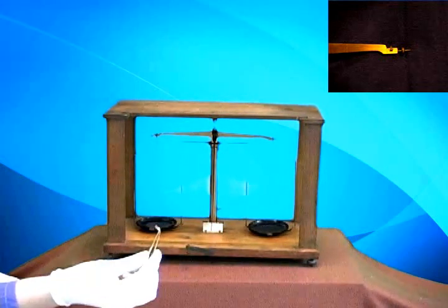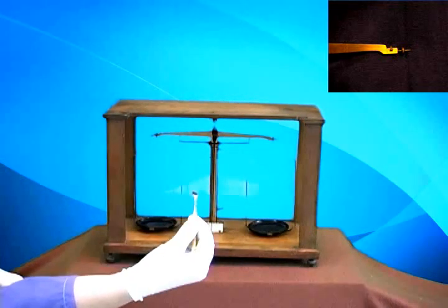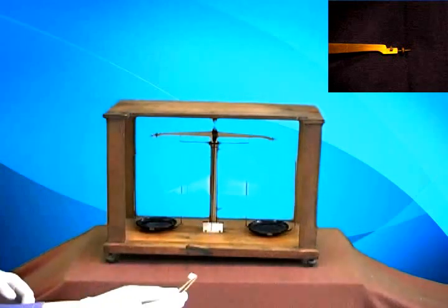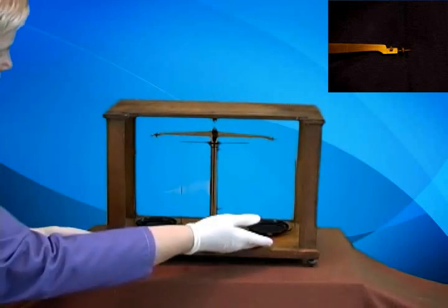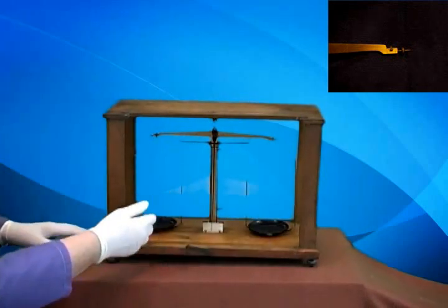For example, here is a 200 milligram piece of metal. It's engraved on there. And they would place the material to be weighed on one side, and they would begin adding weights.